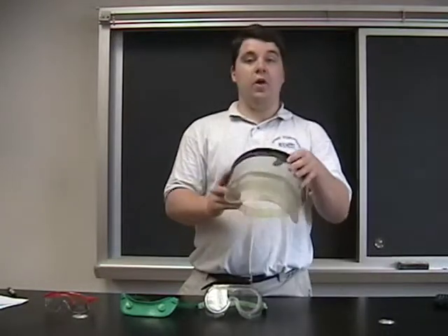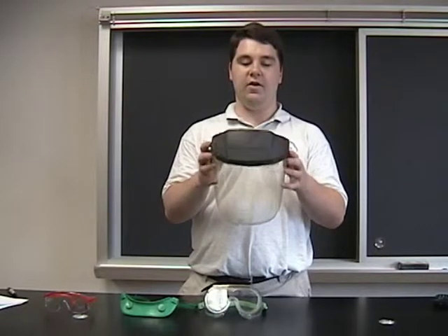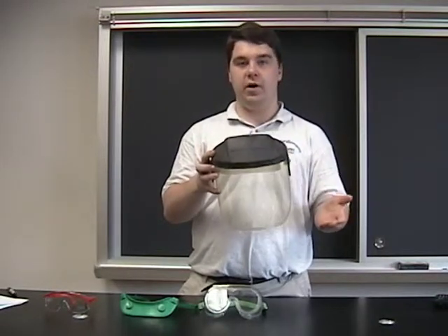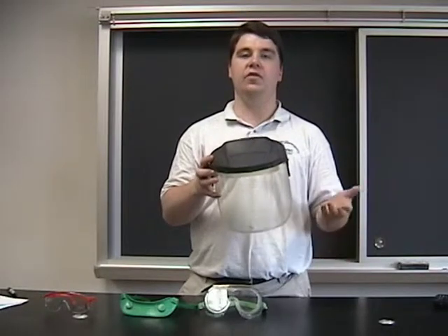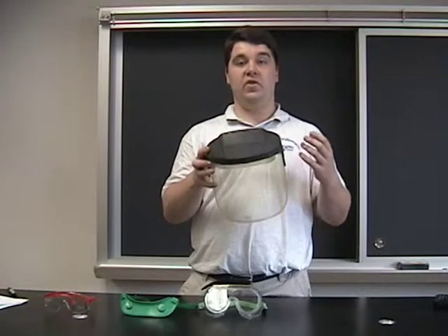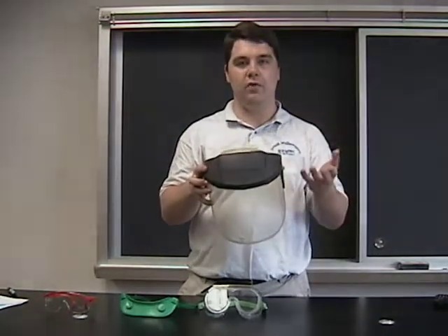Of course, the ultimate in protection you could have would be a full face shield. This type of thing is used when you're working with especially caustic items like hydrochloric acid, sulfuric acid, nitric acid, or when you're working with things that are potentially explosive or could come shooting up out of the glassware.